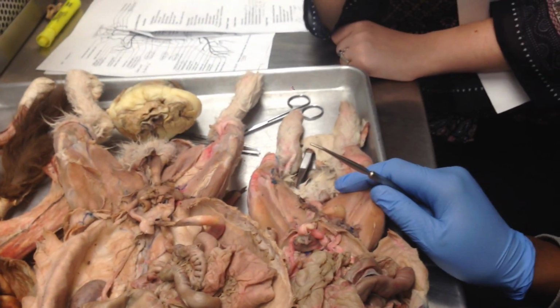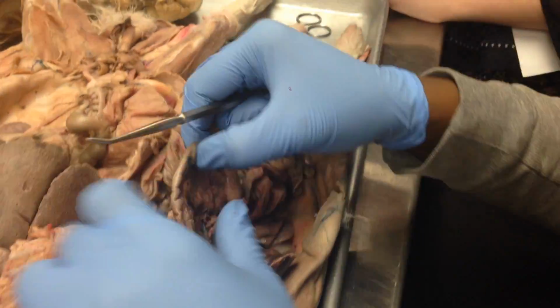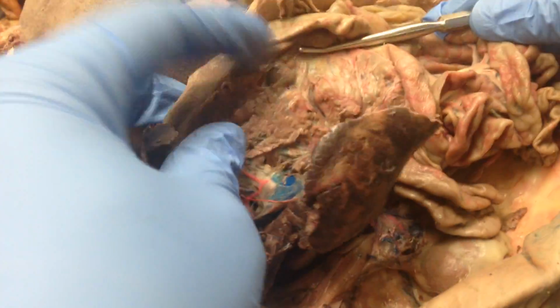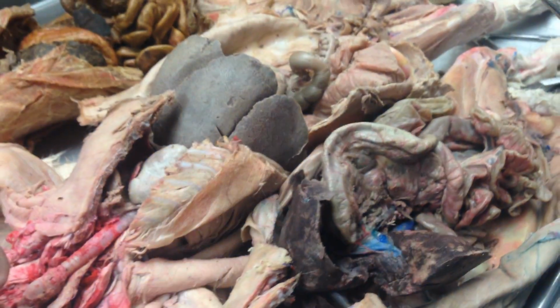And then the last one, the pancreas. The pancreas is exploded, but it's right there. It's all pancreas. All right, that's it.